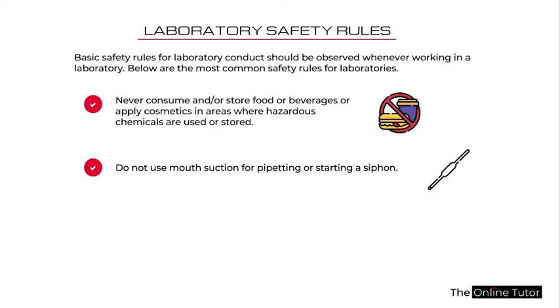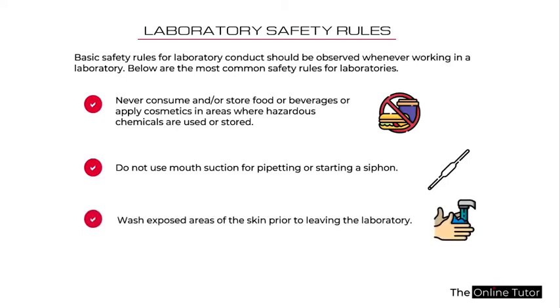Now, do not use your mouth suction for pipetting or starting a siphon. Mostly a lot of people do this in less endowed laboratories that do not have all the necessary equipment. You normally use your mouth to do the suction or pipetting when you are carrying out some experiment. This is really, really bad. This is a very bad habit. So let's try to avoid using our mouth to do suctions when you are in the laboratory.